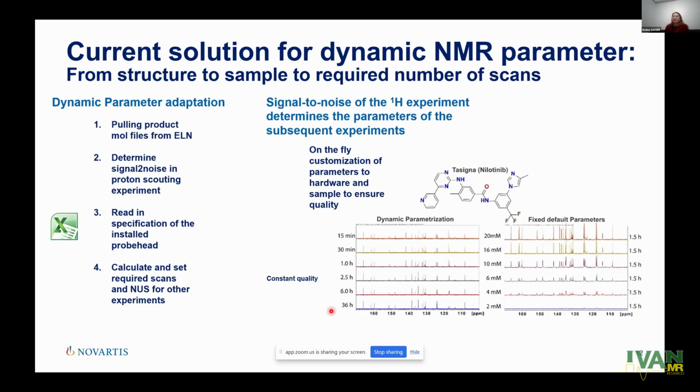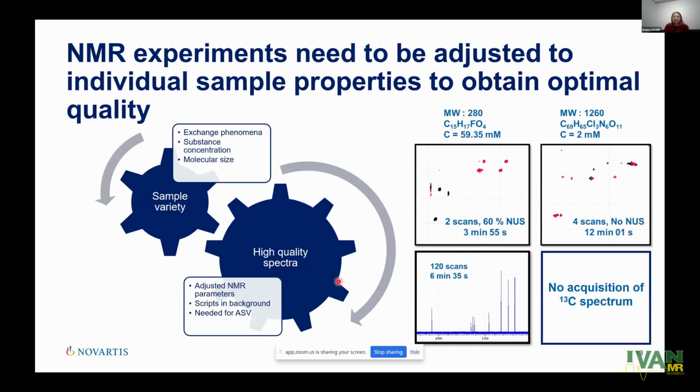This is sure, we will not measure 36 hours of carbon or 6 hours. We decided to block at 2K for 1 carbon in the automatic way. If more is needed, we can adapt it, but the chemists can't change NS of all 2D in our case. Everything is done automatically. And this is done by now.